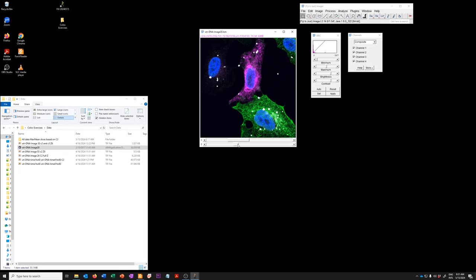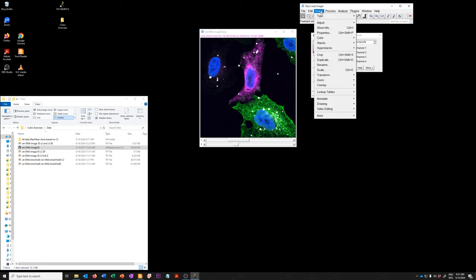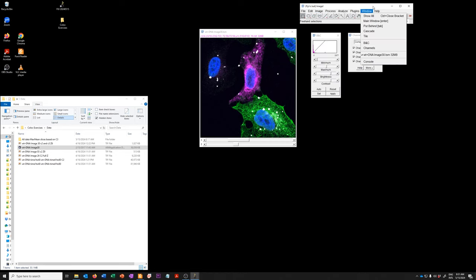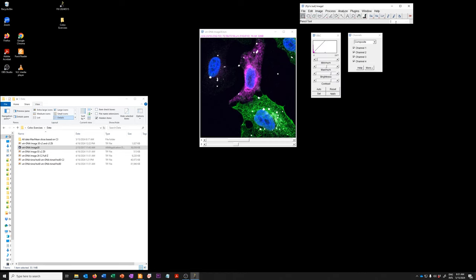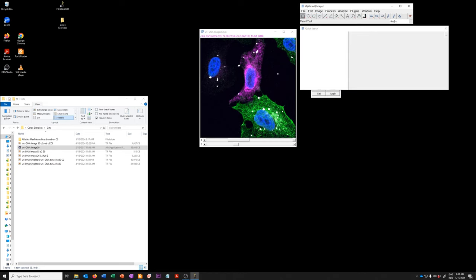To make that subset, we're going to use the duplicate command, which is image duplicate or CTRL-SHIFT-D. If you don't know where this is, you can also find commands by typing them here if you remember what they're called. That's going to be this one.